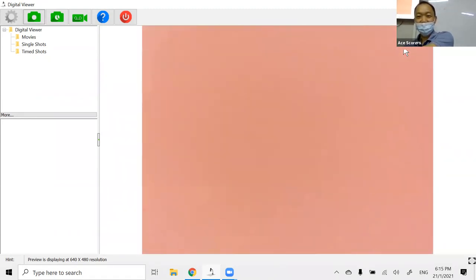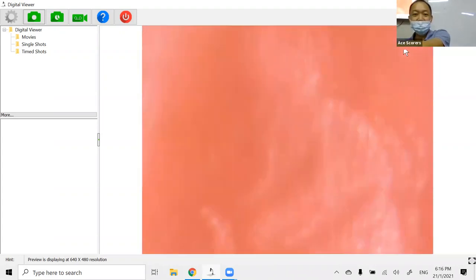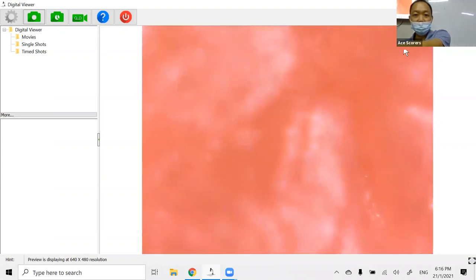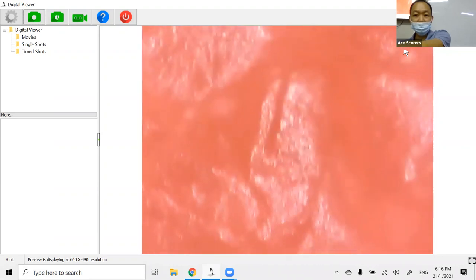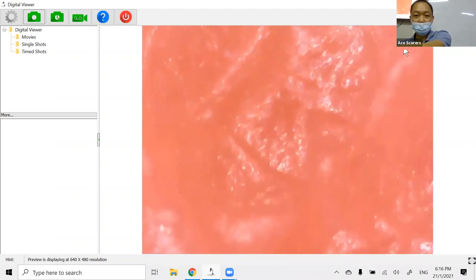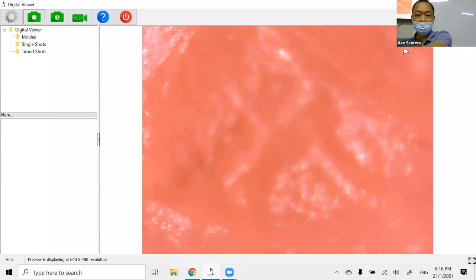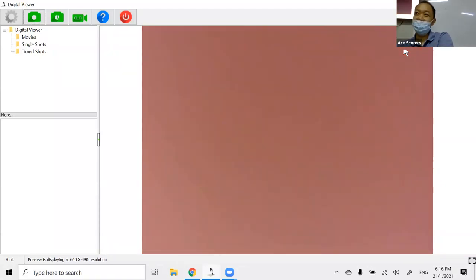We can see many other things, right? Why is it so weird? This is your skin, no? So this is cells. Now I can't really see a cell, but you can see very close. Last year, the students found an ant and zoomed into it. Guess what they saw? They were searching for the face, and then they saw a smiley face. The ant was like that.